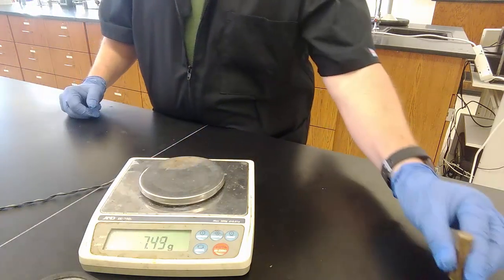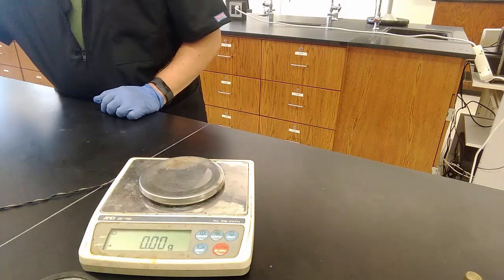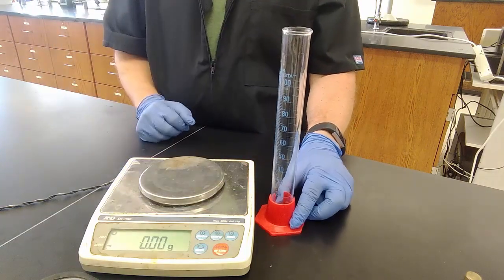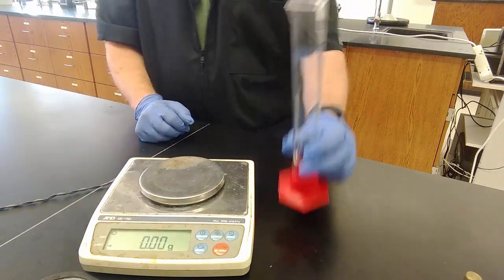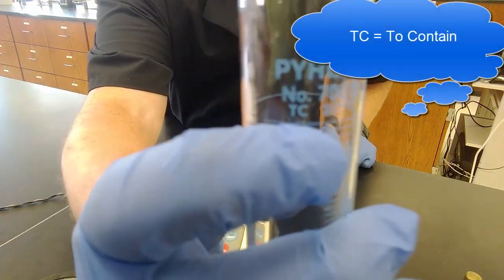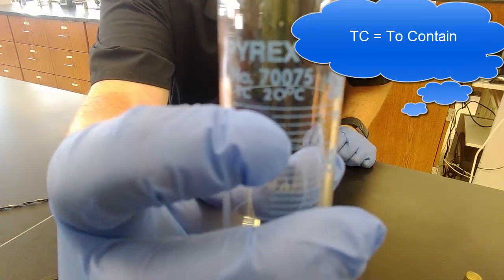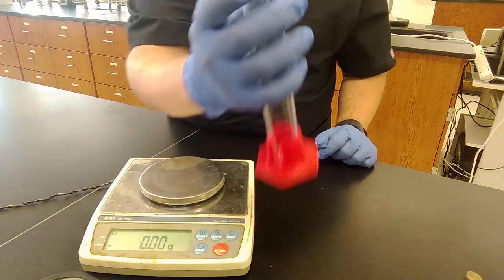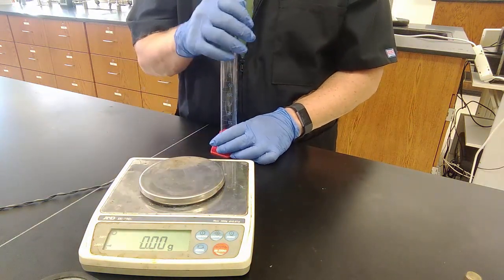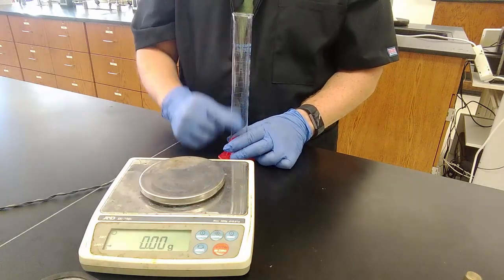Okay? Now, on to step 3. I have a 100 milliliter graduated cylinder, which is a precision measuring device for liquids. It says on it that it is to contain, TC, to contain at 20 degrees Celsius. Now it is much warmer than 20 degrees Celsius in here, so we might have some expansion of a liquid, which often happens. As you increase the temperature, the liquid tends to expand, but we're going to disregard that.